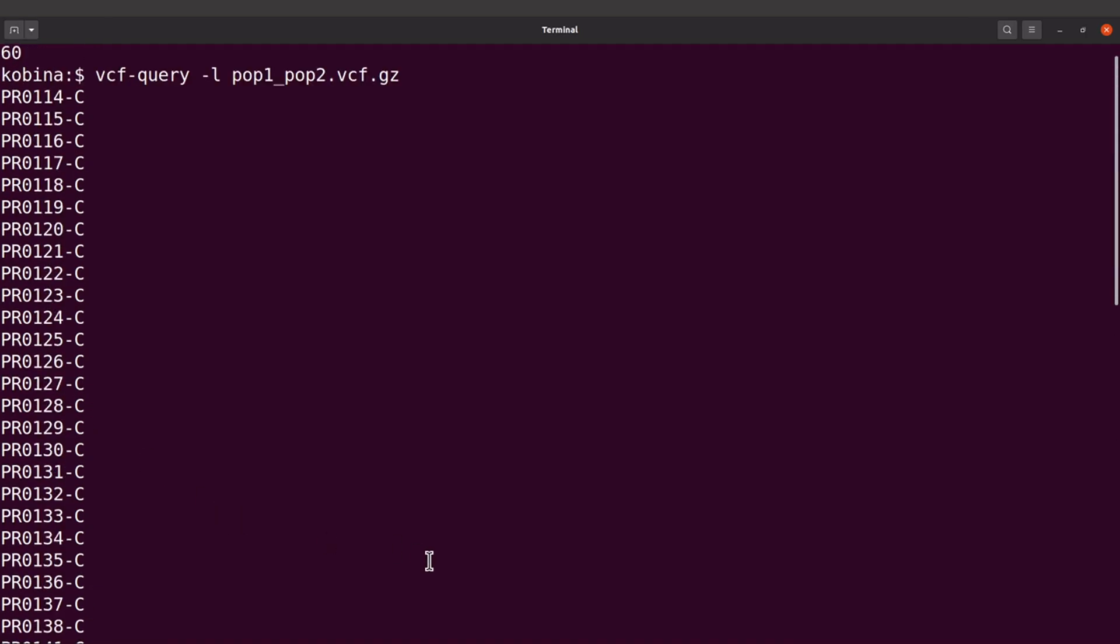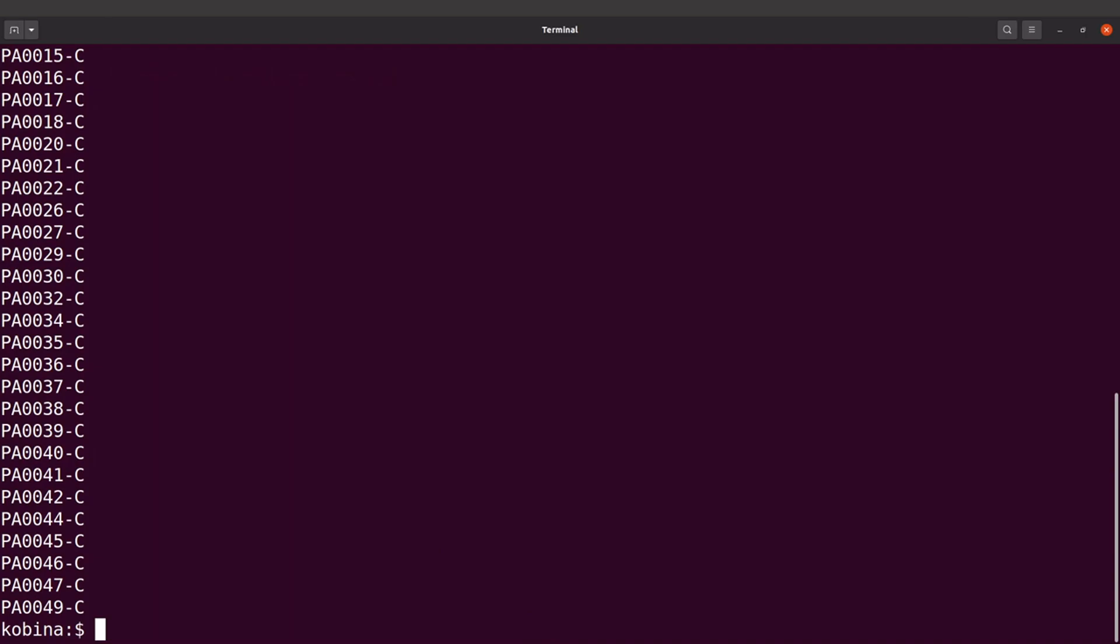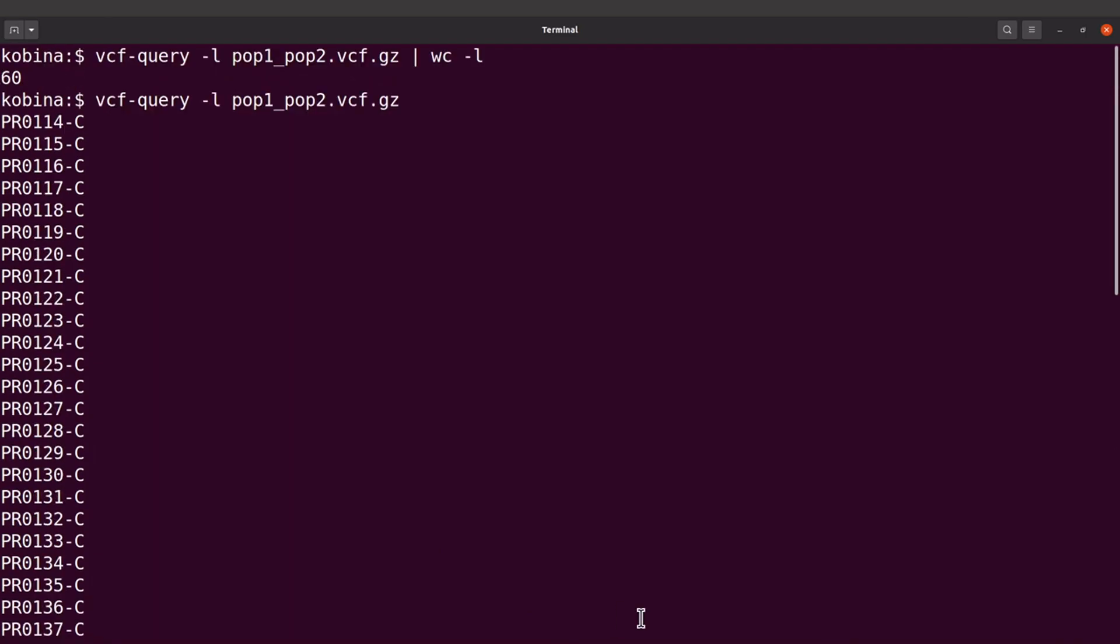Okay, so if we are going to compute the FST values then we need to have the sample names or the sample IDs, if you call it that way. We need to have them in different files. So the samples for isolates taken from the Gambia will have to be in one file and then those taken from Bangladesh also have to be in a different file.